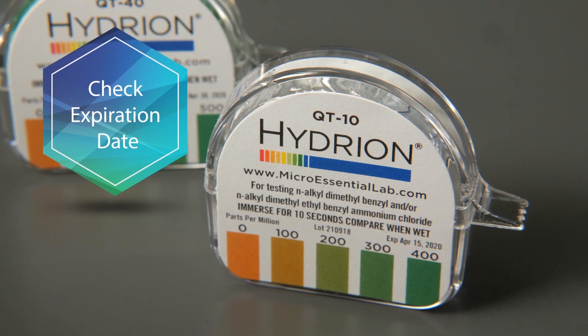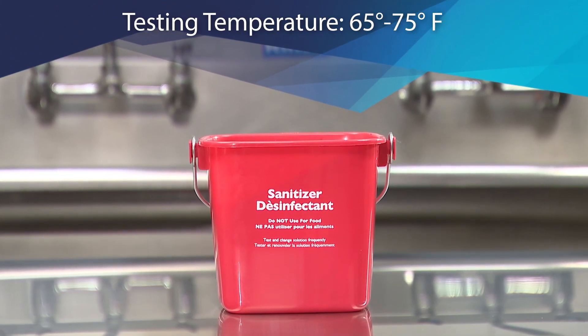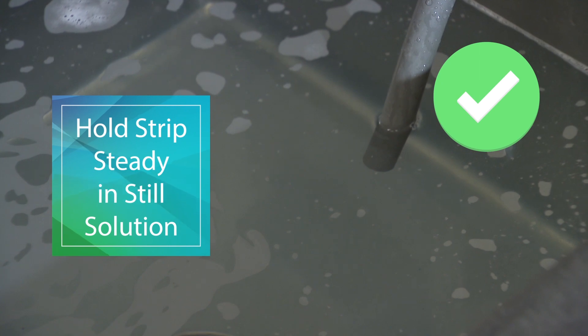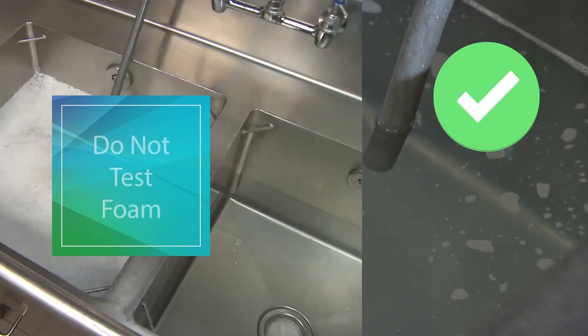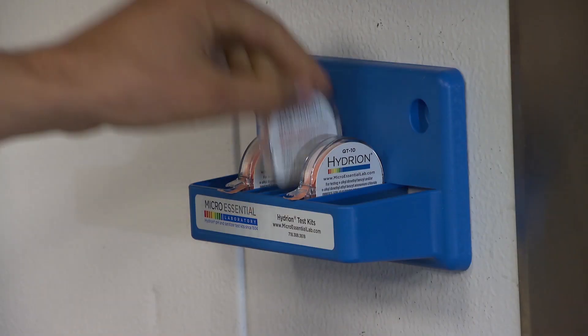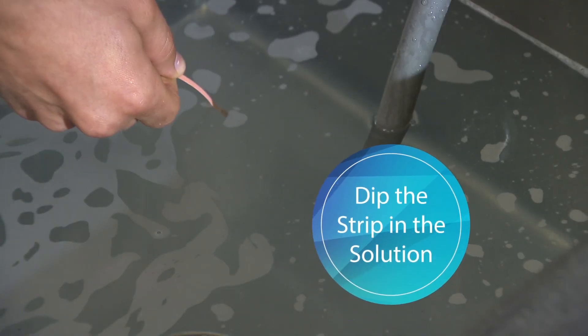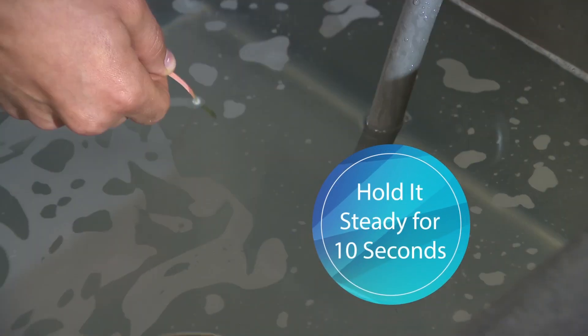Always check the expiration date before use. The QUAT test solution should be between 65 and 75 degrees Fahrenheit. Make sure the solution is still and the foam is dispersed — moving the strip or testing just the foam can lead to elevated readings. Tear off two inches of test paper and dip the strip into the sanitizing solution.